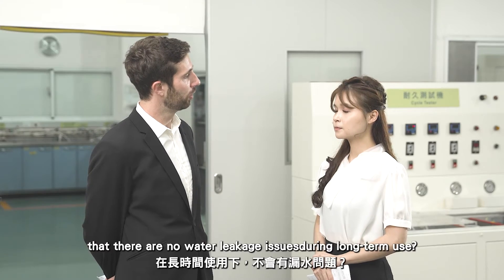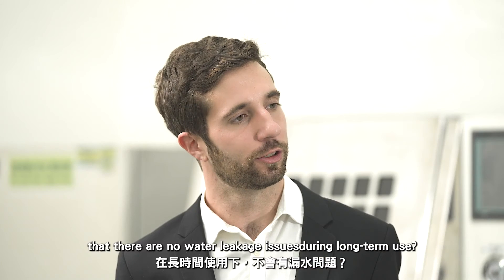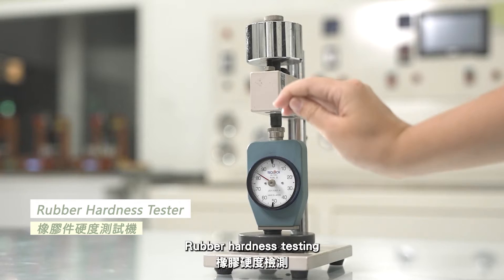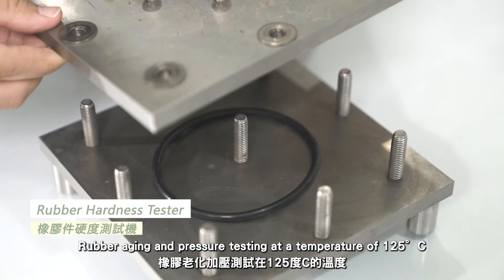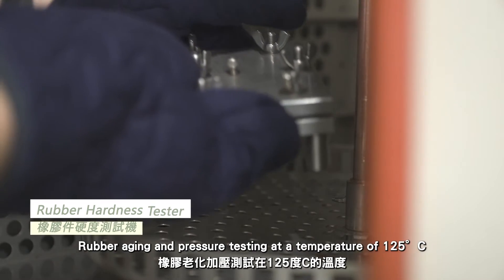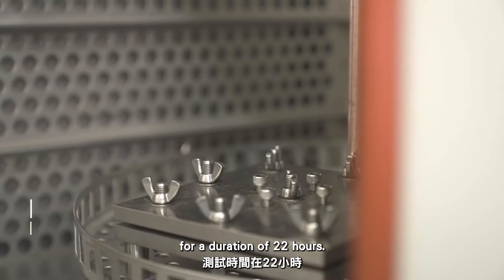How do you ensure there are no water leakage issues during long-term use? We will conduct the following tests: rubber hardness testing, rubber aging and pressure testing at a temperature of 125 degrees Celsius for a duration of 22 hours.